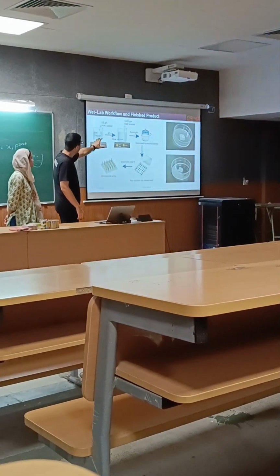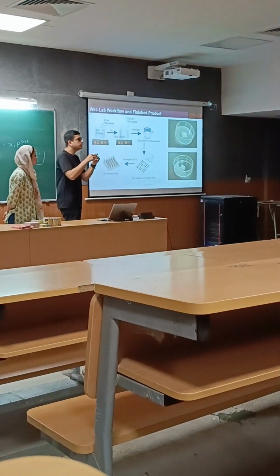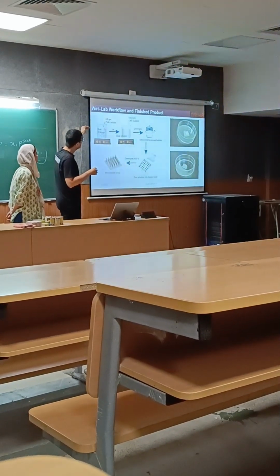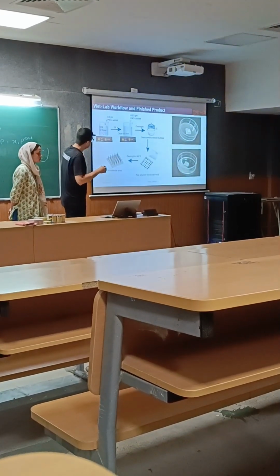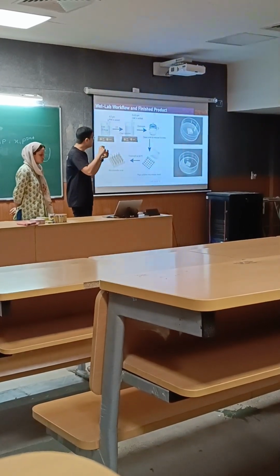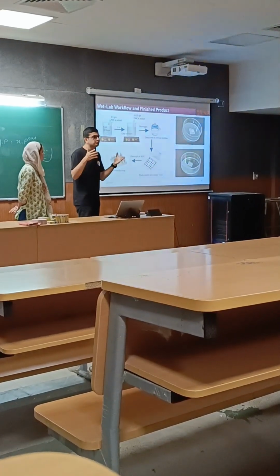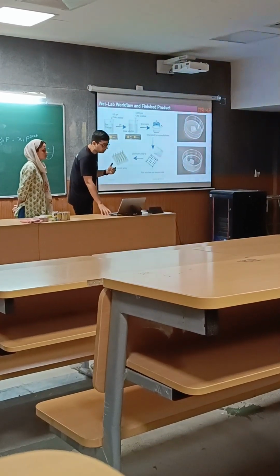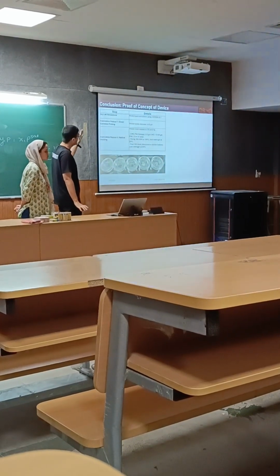The first sample gives us a rather hard structure, but it's not flexible. So in order to increase the flexibility, we again tinkered with the different amounts of PVA and CMC, as well as the DI water that we are inputting into the system. The final material that we got had reduced durability, but it had flexibility. Again we have to optimize the solution, but these are the results which we have obtained from the replica molding.